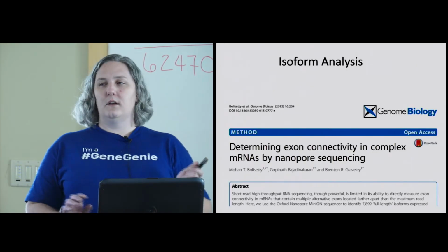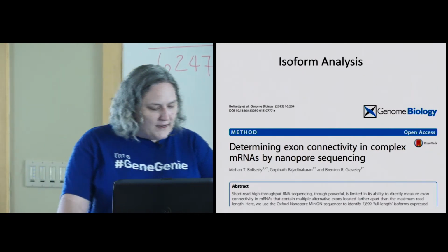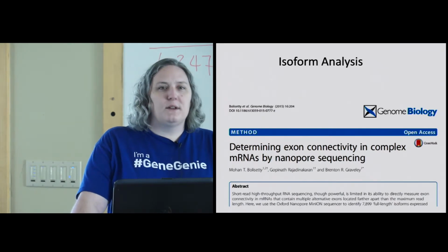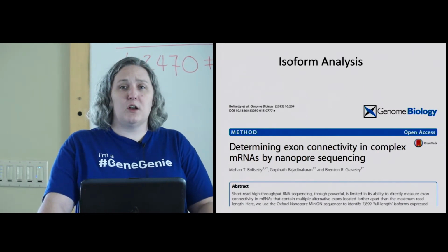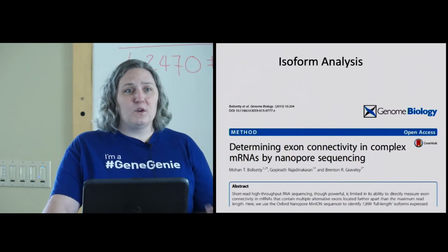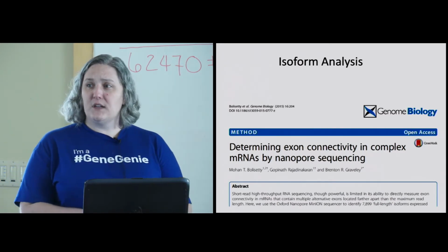All right, next case study. Isoform analysis. With long read sequencing, you're able to get structural elements that you can't get with short read sequencing. So if you want to know the actual structure of isoforms in an RNA transcript, and you want to know the connectivity, long read sequencing is a very good approach, which is quite established now on the PacBio platform, but it also can be done on the Oxford Nanopore platform.